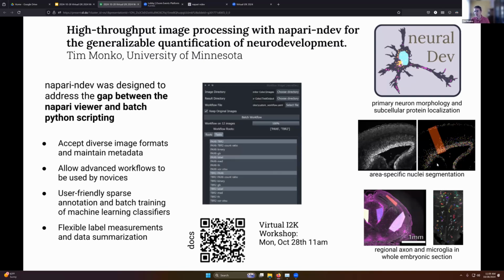We've got nuclei segmentation, which we'll actually work on in the tutorial, and we have a specific region of interest. We're specifically wondering how many cells are in this area, because in this embryonic brain, this will become a certain region in the future brain, and so we can consistently annotate our images. This is something that's currently difficult to do in Napari in my experience.